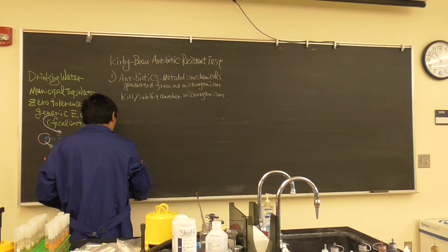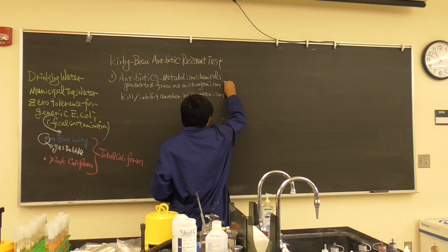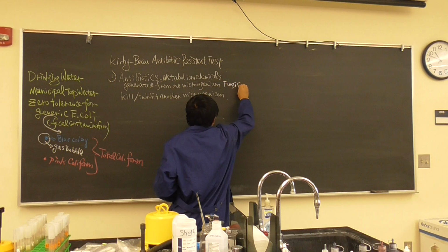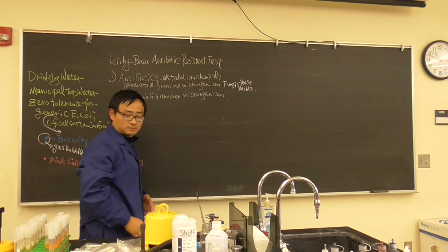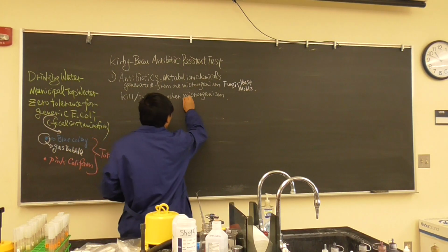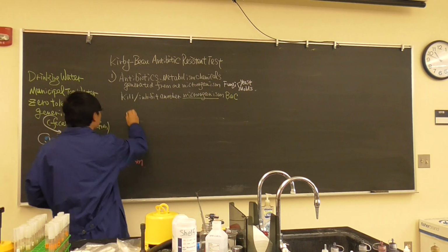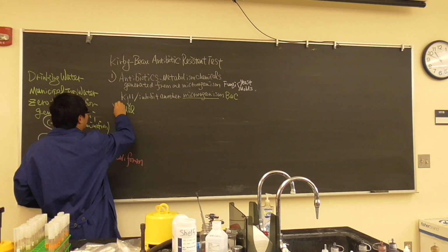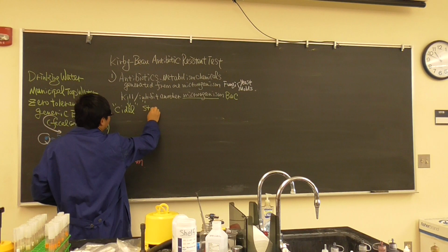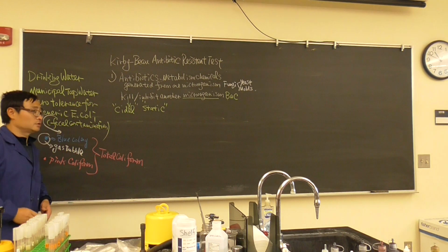And I said this first microorganism most of the time is fungi, could be yeast or sometimes molds, let's say penicillin. And this other microorganism, most of the time we mean bacteria. And what does kill mean? That is the terminology cidal, and what inhibit means is static. Okay, so that's a very brief review.